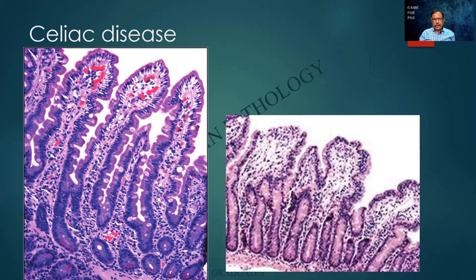But there is something called morphometry. Morphometry means you measure the height of the villus, the depth of the crypts, and the number of villi in any one square unit area. Whether they are all uniform, whether they are all blunted or sharp, these are the things that we will have to see. Sometimes you find that the adjacent ones almost become merged together and it becomes flattened. These are all indications of an atrophy.